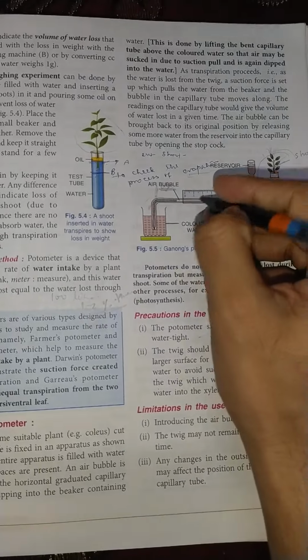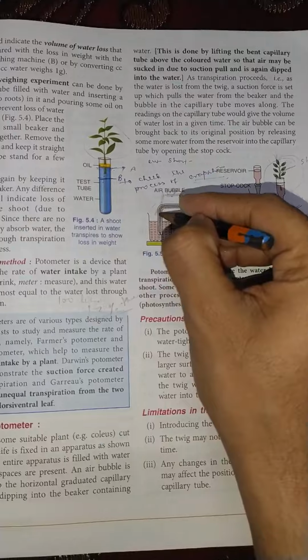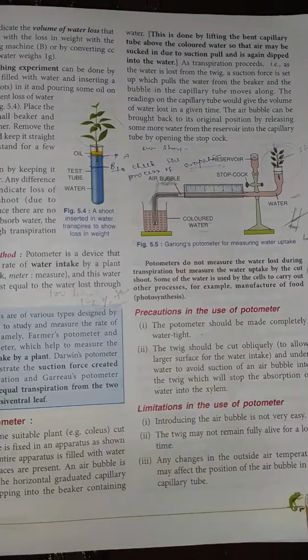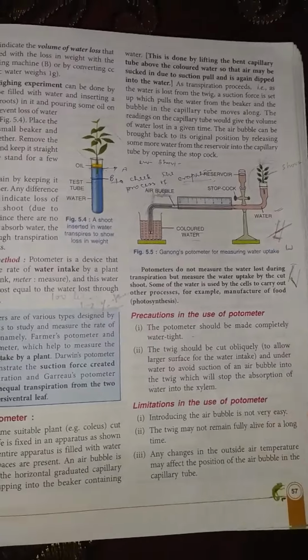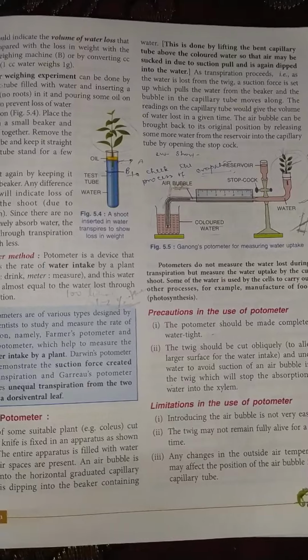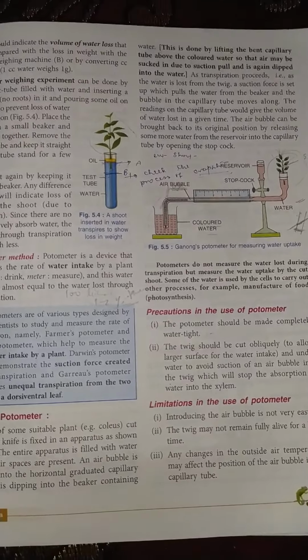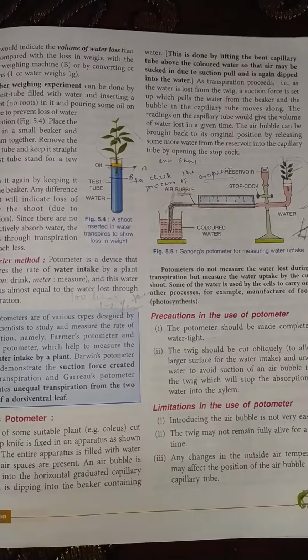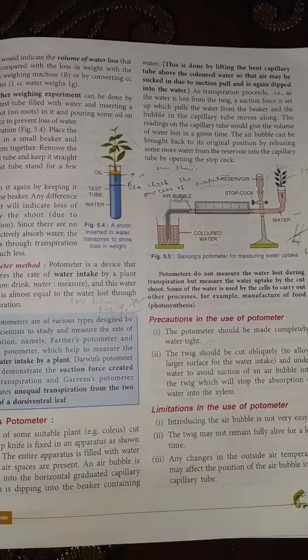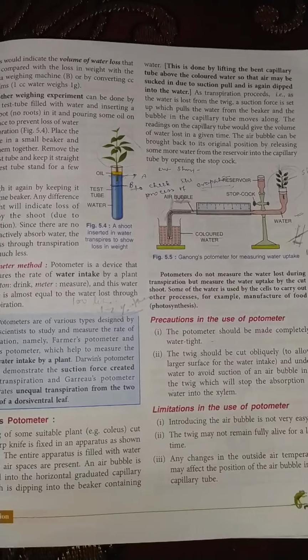अब क्या करेंगे, एयर बबल कितना मूव किया in 2 hours. मान लेते हैं एयर बबल 2 घंटे में 3 सेंटीमीटर या 4 सेंटीमीटर या 5 सेंटीमीटर मूव किया. That is our reading, that is the reading of the water intake by the plant shoot. और ये रीडिंग ही क्या कहलाएगा कि कितना पानी a plant has lost due to the transpiration. Again I am telling that potometer is not a device to measure the rate of transpiration.